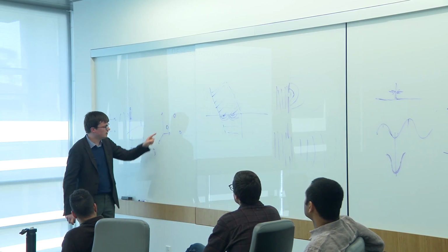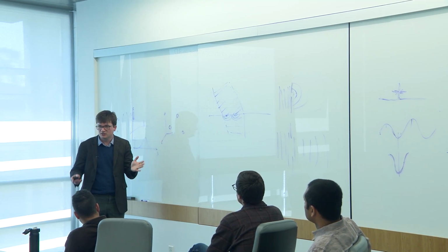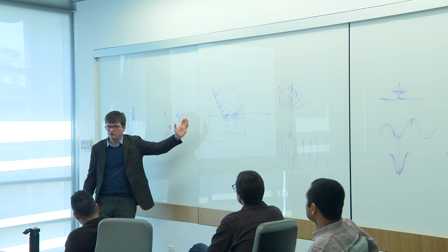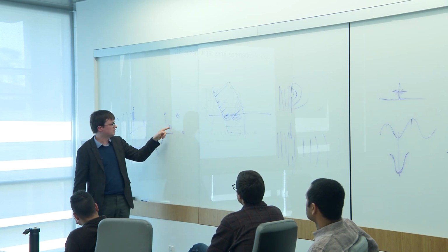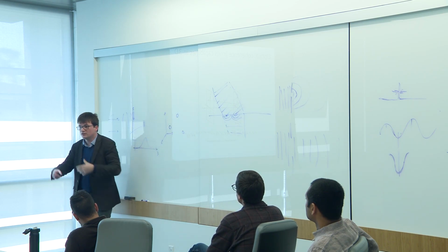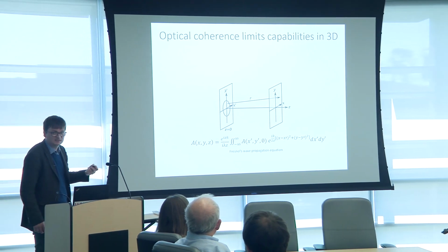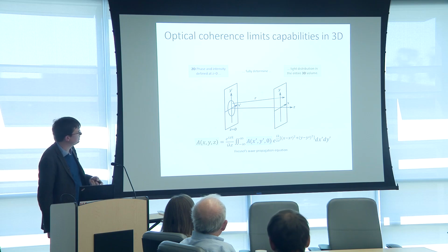Namely, you want a lot of photons here, a lot of photons here, a lot of photons here, and no photons anywhere else. Basic principle of wave propagation tells you this is not possible because the amount of photons that are coming through along the optical axis has to be conserved. So for instance, right here, there is no light. The photons that reach those targets have to come from somewhere. Therefore, this type of illumination is not even possible in the first place. So the problem becomes, what is the best way to make the most likely acceptable hologram that matches the illumination pattern that you want? So that's, we've seen that before.